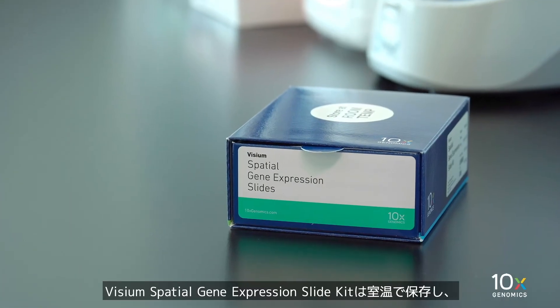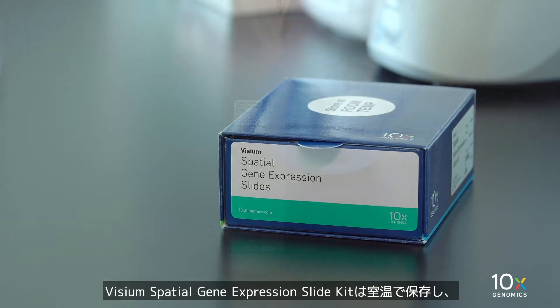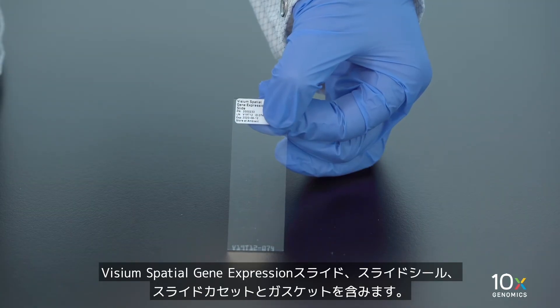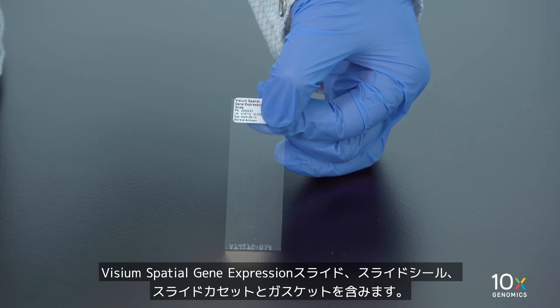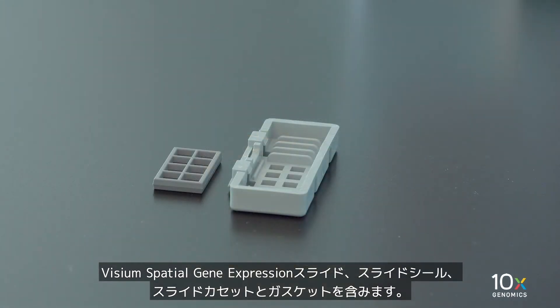The Visium Spatial Gene Expression Slide Kit is stored at ambient temperature and contains Visium Spatial Gene Expression Slides, Slide Seals, Slide Cassettes, and Gaskets.